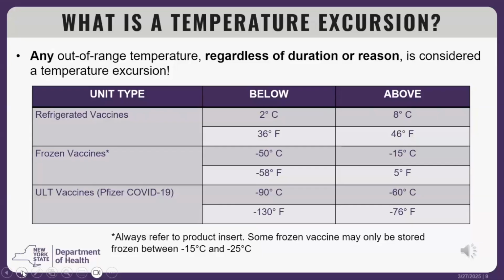The grid on this slide shows the appropriate vaccine storage temperatures by storage unit type. While this is helpful, always refer to the vaccine package insert, as some vaccines may have more restrictive storage ranges.